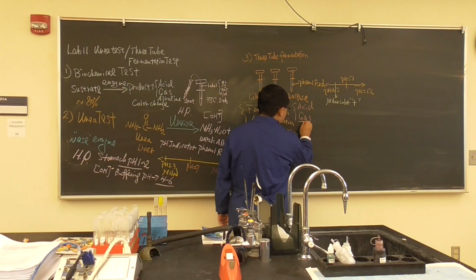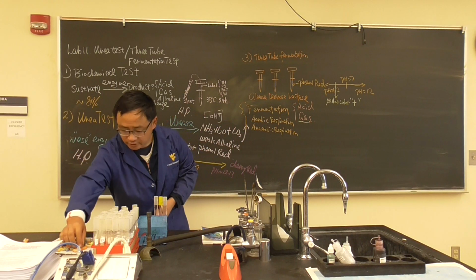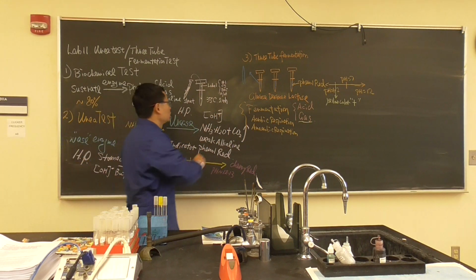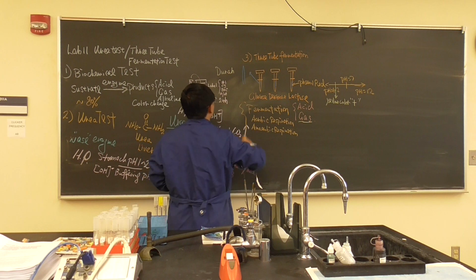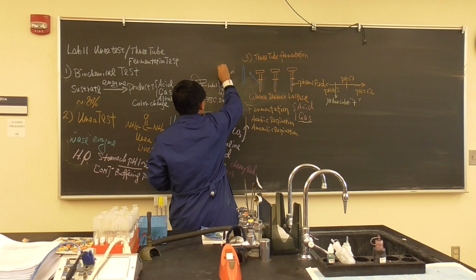How about the gas? Inside, we have this tube. It's called a Durham tube.